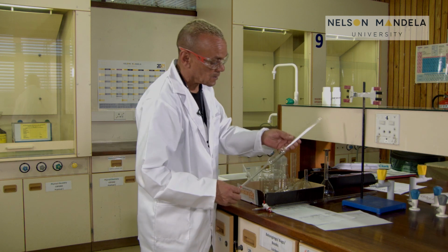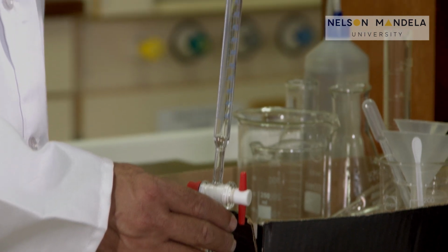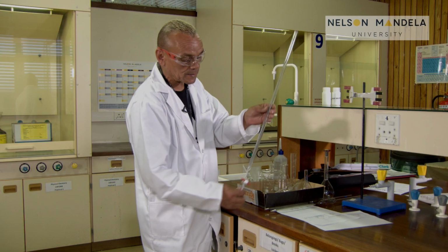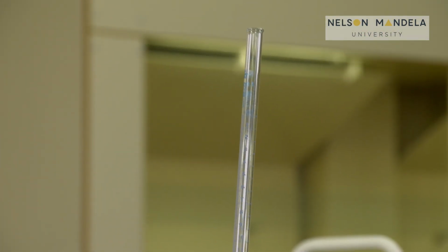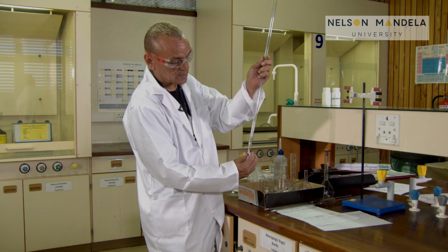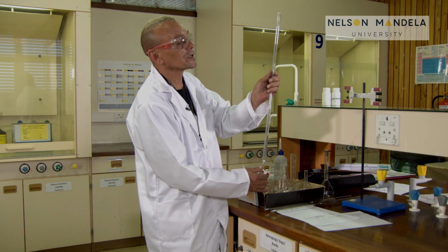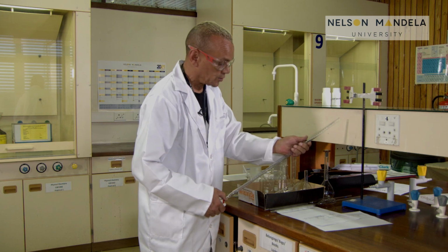You've got pipettes, which are volumetric glassware, designed by glass blowers specifically, and very accurate and precise, very pricey. And one of the more expensive, or the most expensive, inside your locker is what I must identify to you, which is called a volumetric burette, which is used for titrations. At this moment, this is an A-grade burette, and they go for at least 400 Rand per unit plus that. So it's one of the more expensive pieces of equipment. You need to handle them with care.